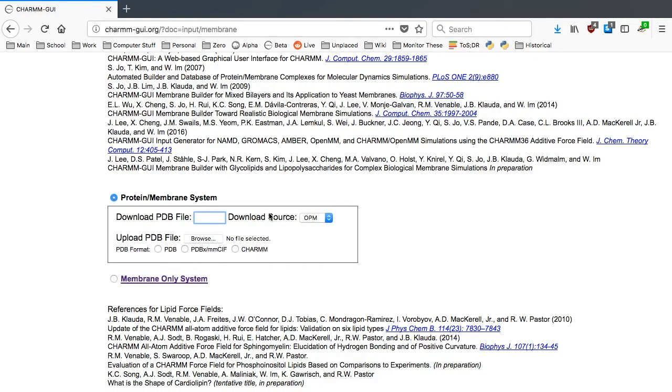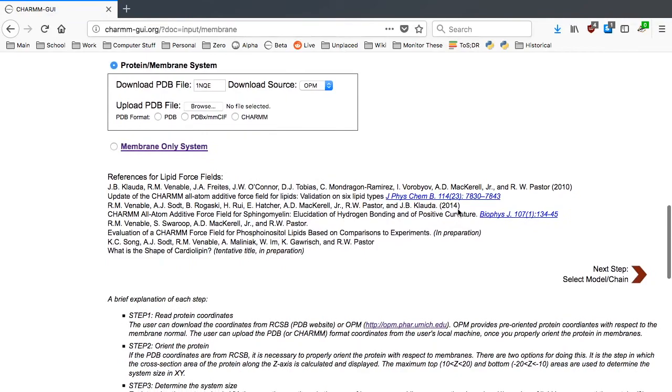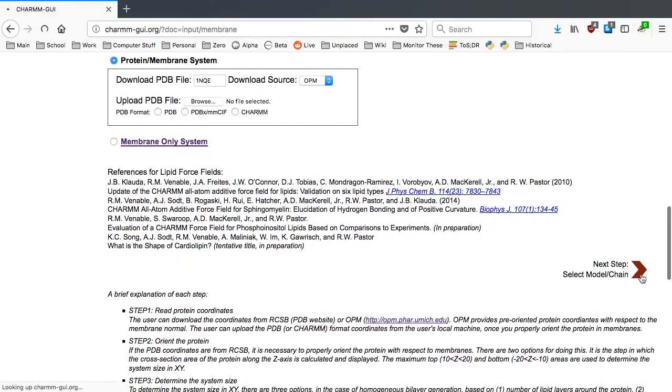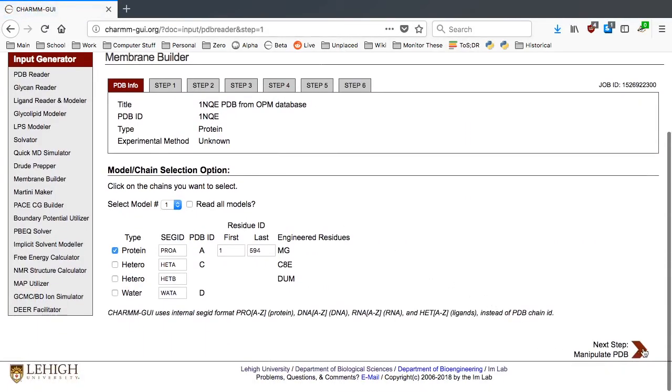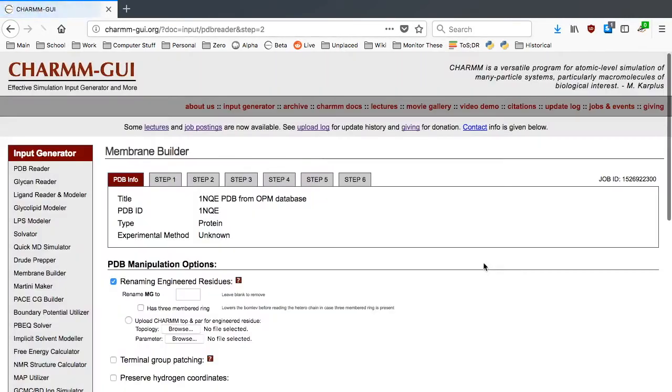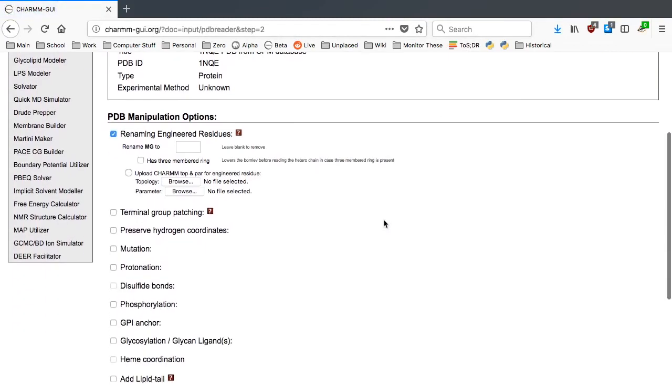Type 1NQE in the text box. This time we will download the pre-oriented structure from the OPM database. Press the next button until you see orientation and positioning options.